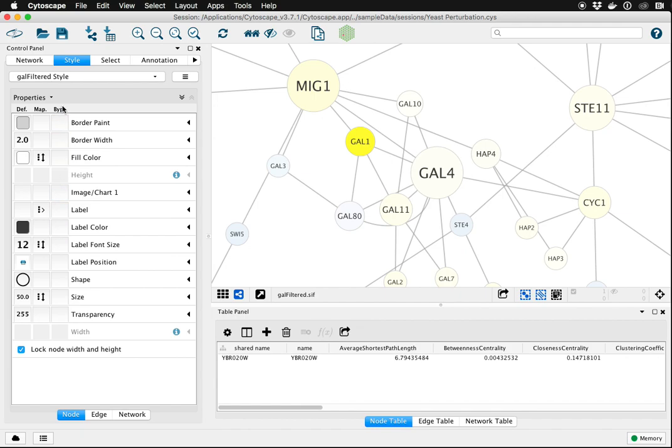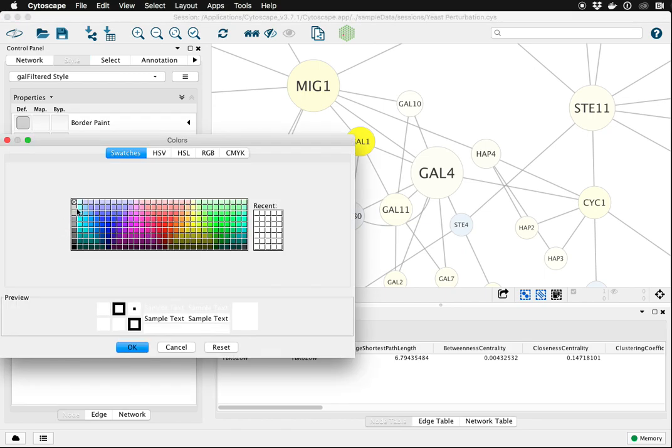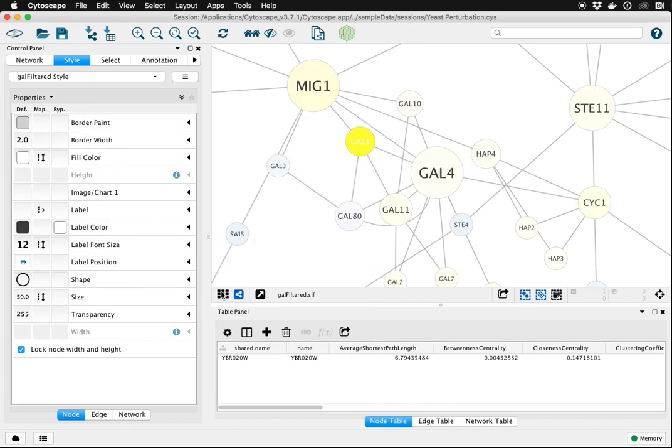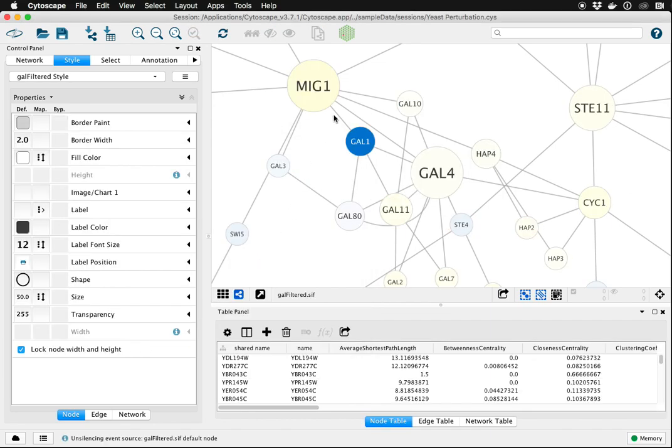Again, that's this third column, bypass column, for label color. Click there, choose white or any better contrasting color. Click okay. And now that particular label is white, all the others remain black, and they're all legible.